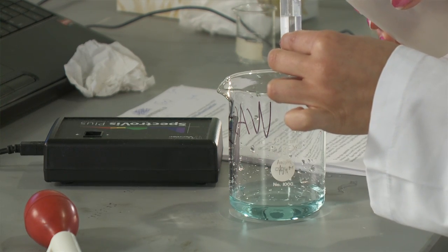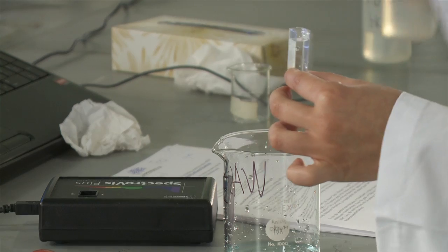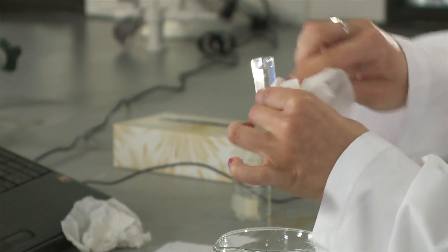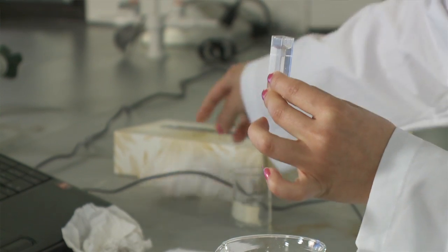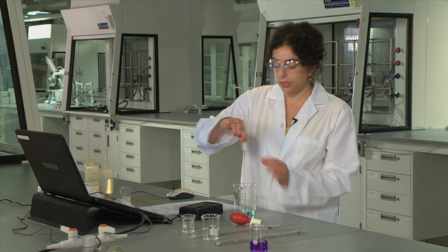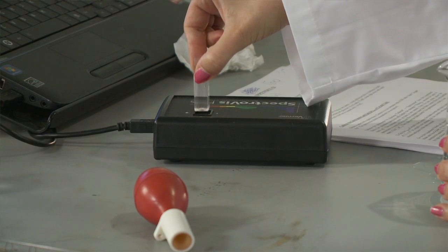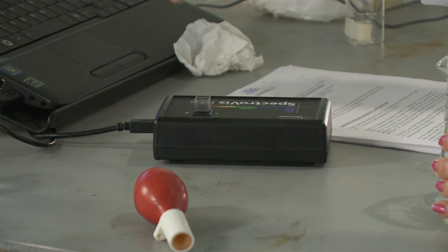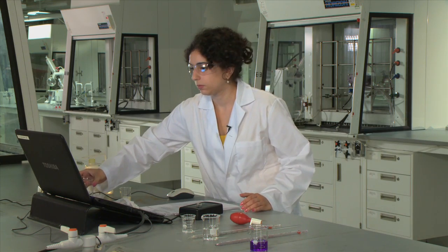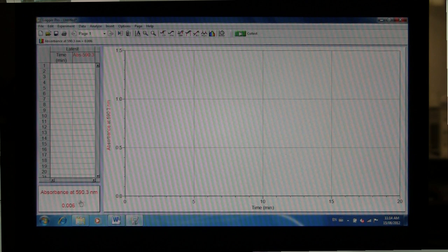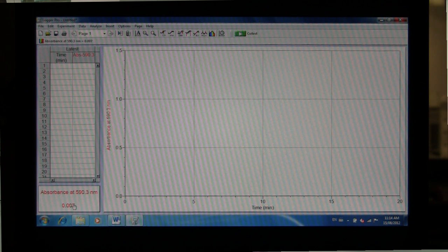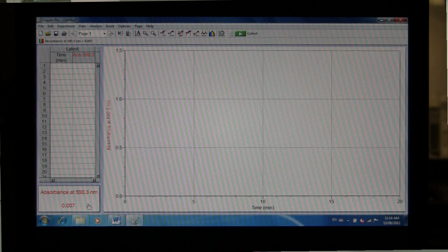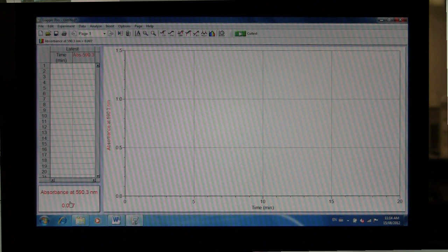And then fill up the distilled water solution. Give your cuvette a quick wipe, and just check the absorbance on the water solution. You want to make sure that in the active display of the absorbance that it's reading around zero. The last digit might fluctuate a little bit, but as long as it is hovering around the zero value, then it's fine. If any of the other digits start fluctuating, then you might need to re-rinse the cuvette.